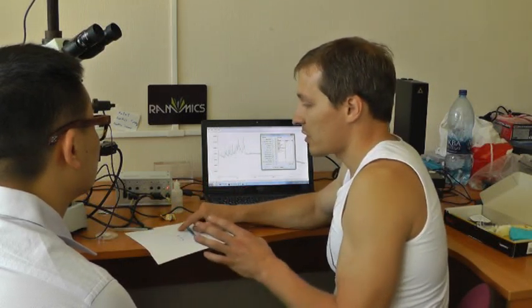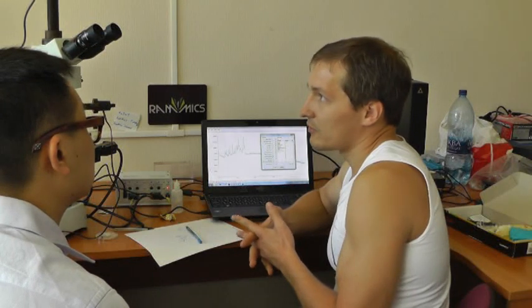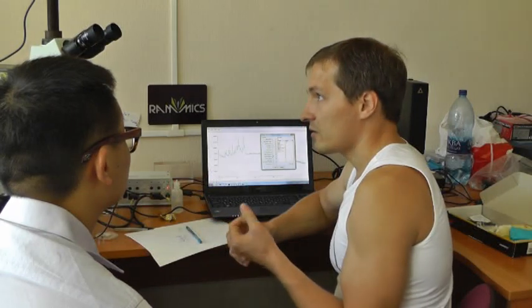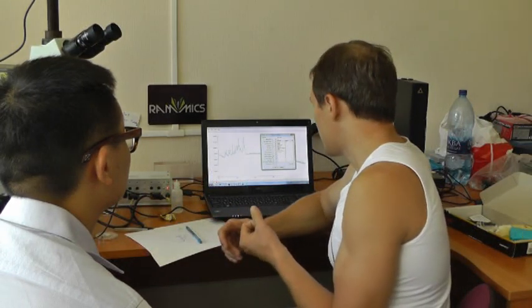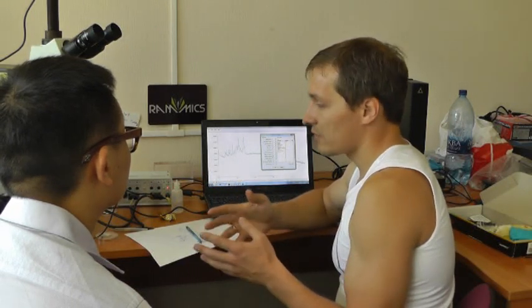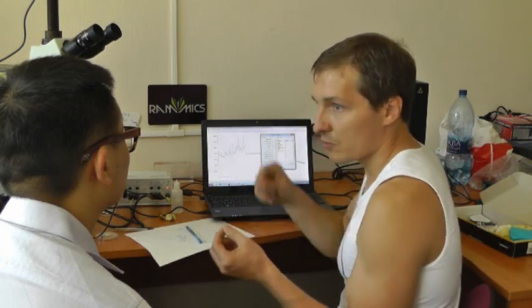I'm not strong in chemistry, but you can imagine that the same substance could be named differently, like a common name we use in life and some special chemical name. We need some criterion to combine the identical spectra and not call the same spectrum by different names.